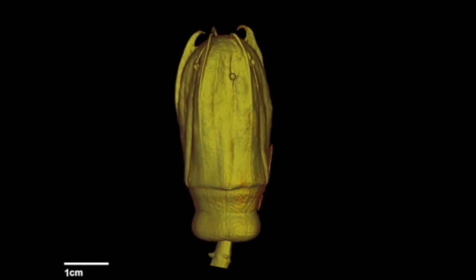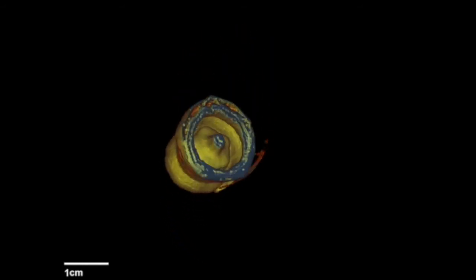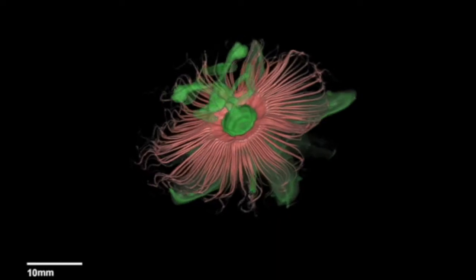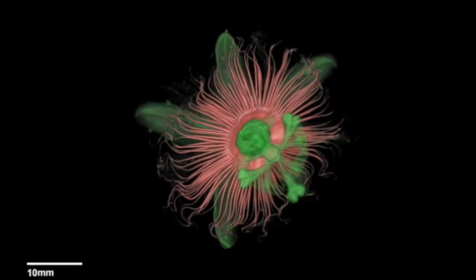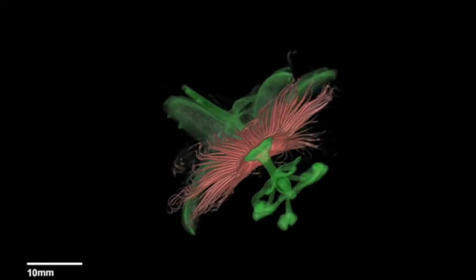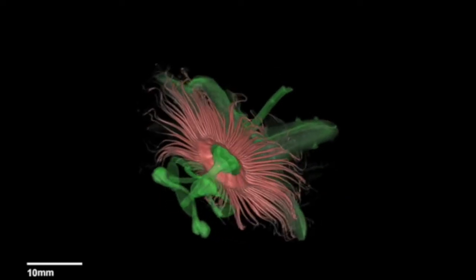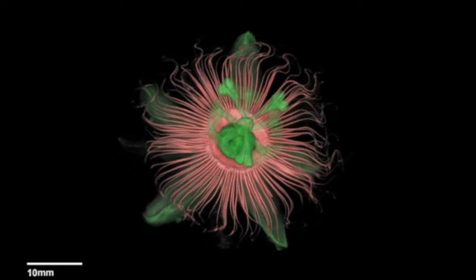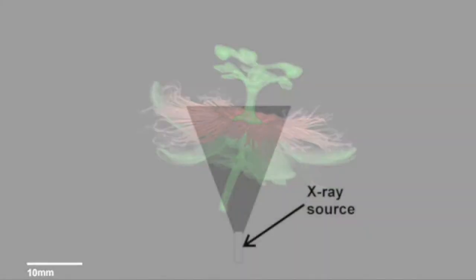This technique is commonly used for animal samples, but has been increasingly used to obtain 3D images from plants. The way the technique works is similar to a hospital CAT scan, but in a smaller scale and with increased resolution.